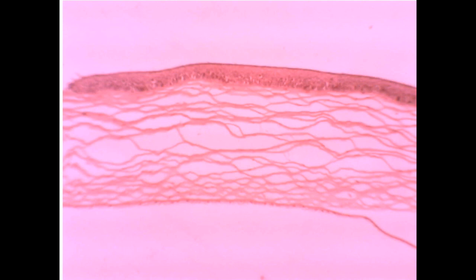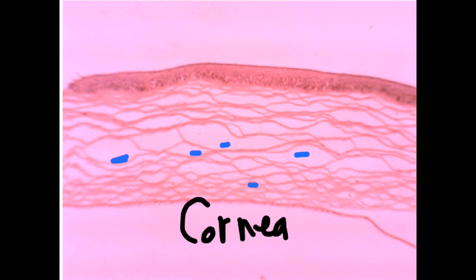Here is the cornea, and the cornea here is characterized by having the zone for the nuclei, one zone only for the nuclei, and then we have the parallel fibers of the substantia propria or the stroma of the cornea. These are red in color, and sometimes you can see in between the nuclei of the fibroblast, but it is not necessary.